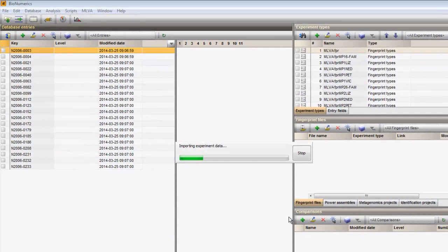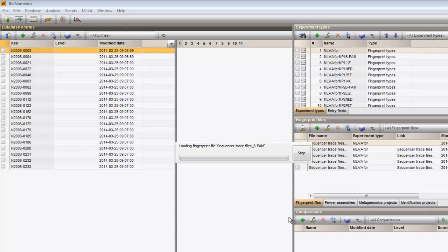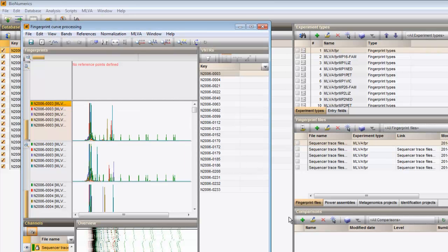The software now splits the curve files into separate fingerprint files per imported die. The individual planes are assigned to their appropriate fingerprint type and linked to the corresponding entries. The fingerprint curve processing window opens.